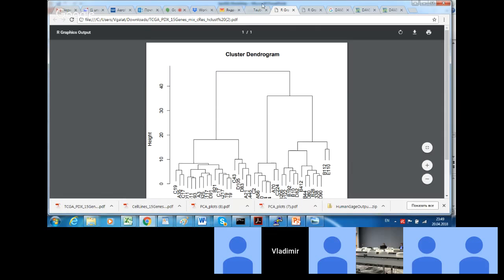Well, we can simply look at the file that's also contained in the output. I'm speaking about 2 clusters, as while running the pipeline, I specified the estimated number of clusters equal to 2. If I specify this number equal to 3, then I'll have cluster IDs for the cutoff height associated with the level that leads to 3 clusters.